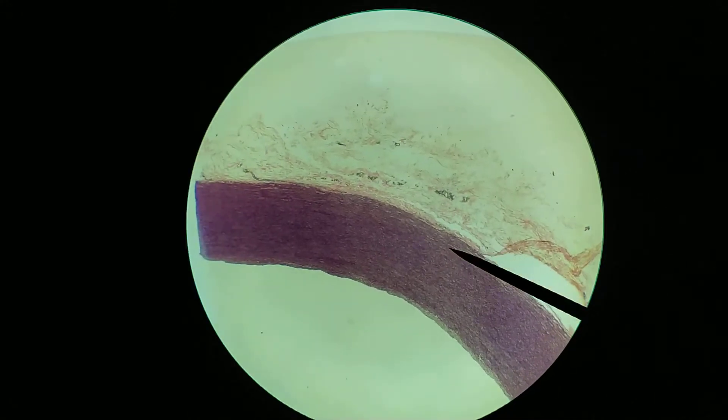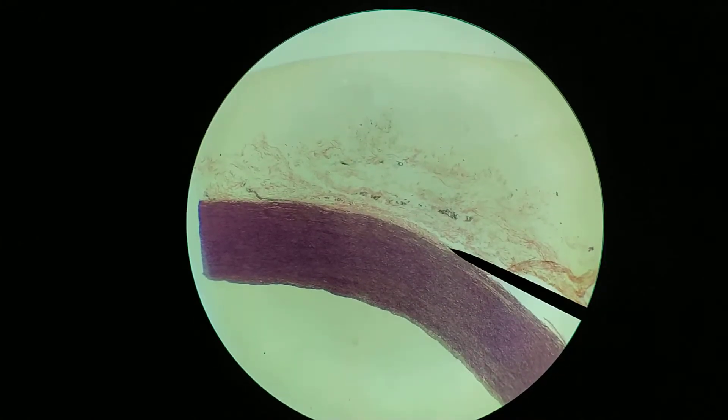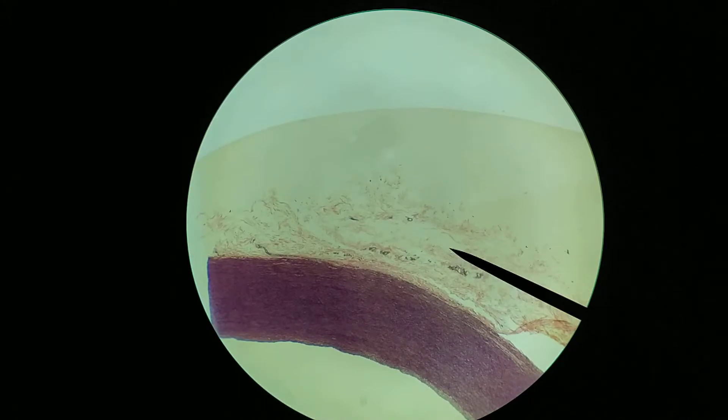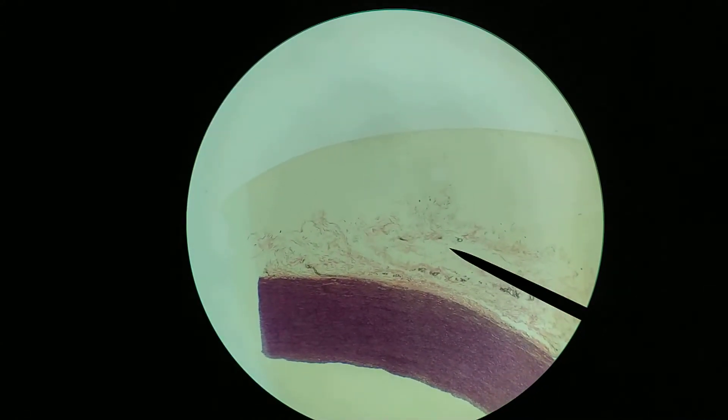Now beyond this, we have the tunica adventitia, which is visible right here, for example. As we go further out, we can see a bit more damage to this tissue. And so it's a little bit atypical in this area here.